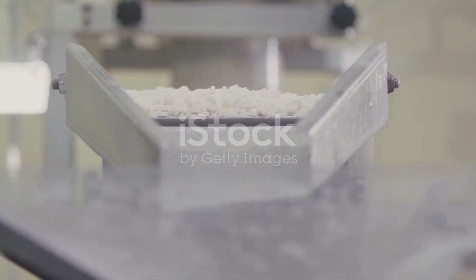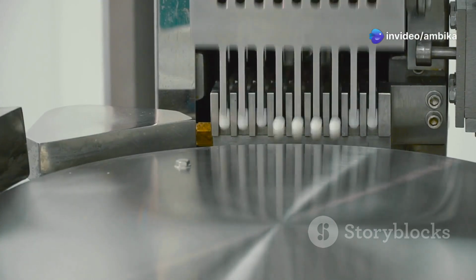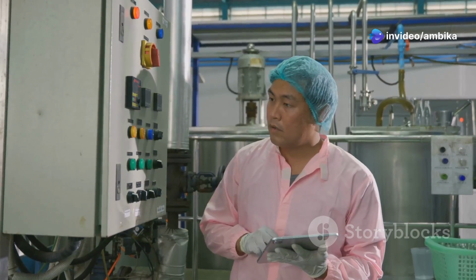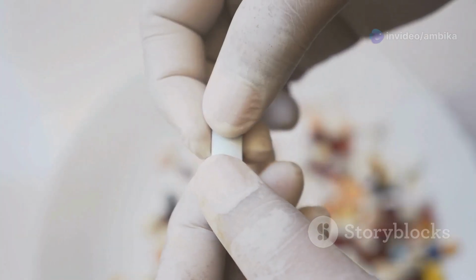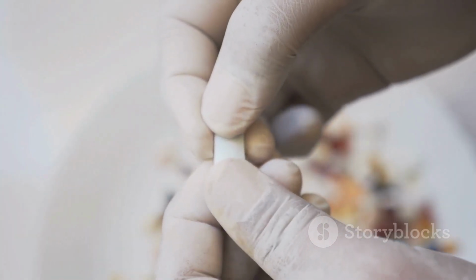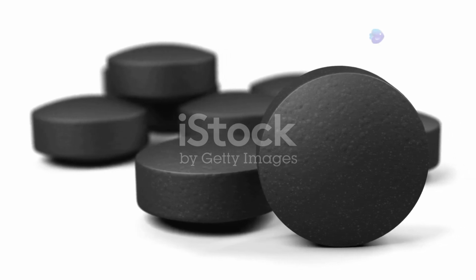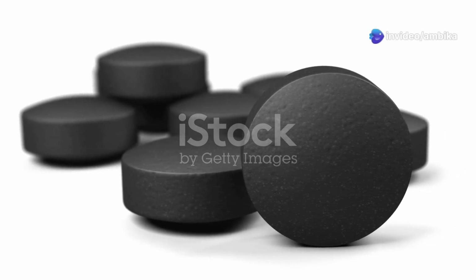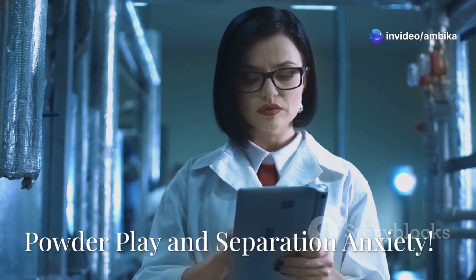Chapter 8. The case of the crushing force. To turn that powder into a solid tablet, we need pressure, but just like Goldilocks and the porridge, it needs to be just right. If we apply too much force, it's like stomping on a grape. Things get messy. The intense pressure can cause the materials to degrade, leading to discoloration. Remember those black specks? Yep, excessive force can be the culprit behind them too.